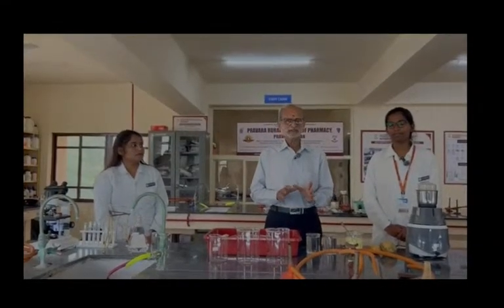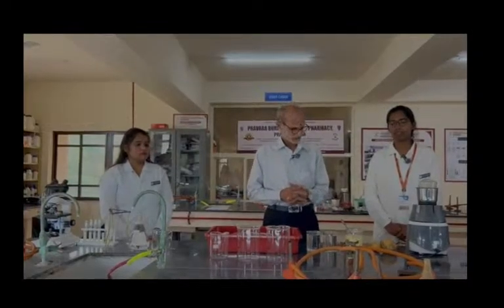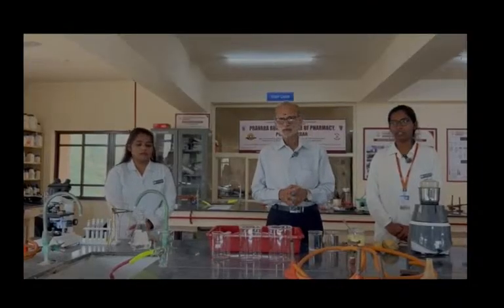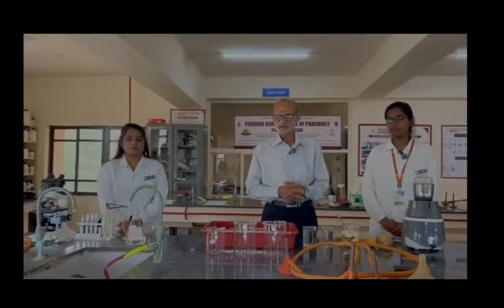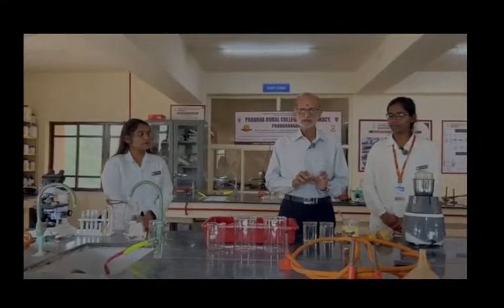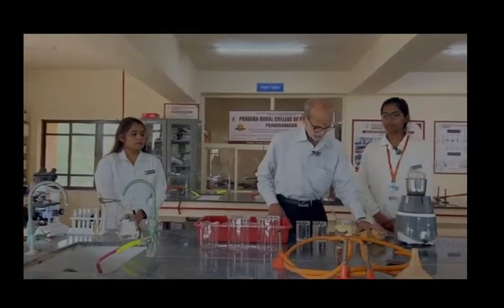There are three important starches. Number 1, and most widely used starch, is cornstarch. Number 2 is potato starch, and the third one is tapioca starch. So they are the important starches, and starches are present in many other plants, but these three are commercially important starches. We are going to demonstrate the starch separation from potato. And here we have a potato.